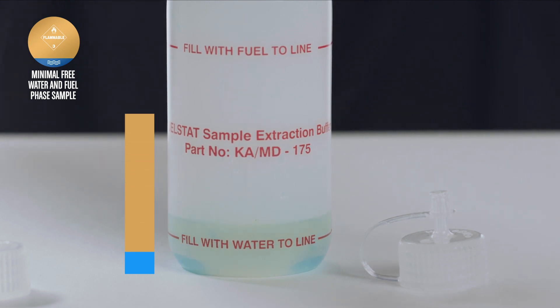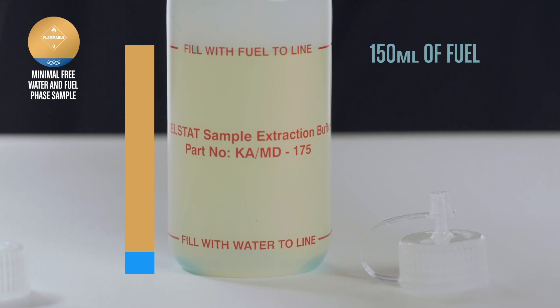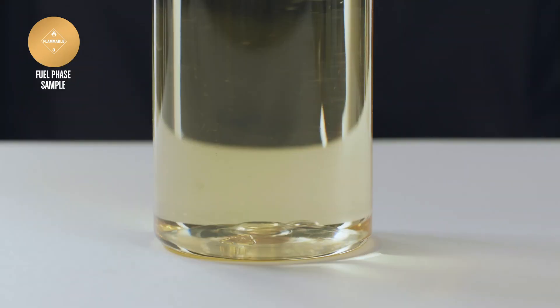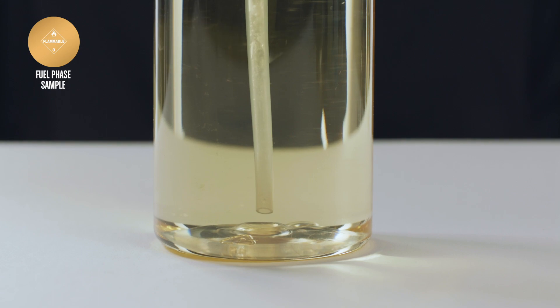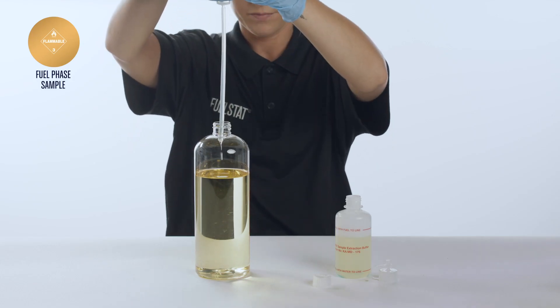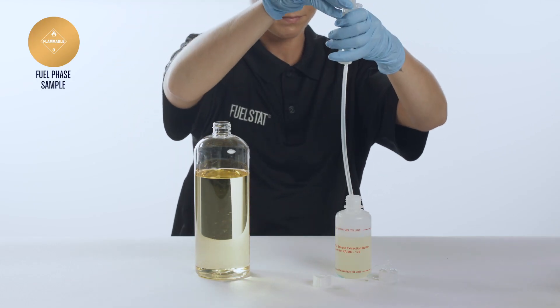You will require approximately 150 millilitres of fuel, which is 6 full syringe extractions. If no free water is evident in the sample, just extract 150 millilitres of fuel from near the bottom of the sample to fill the test bottle to the top fuel line.